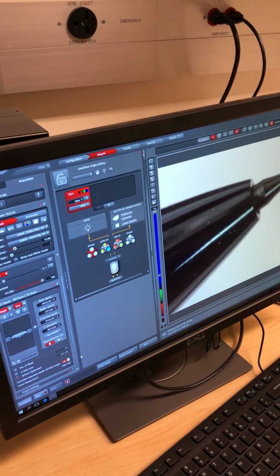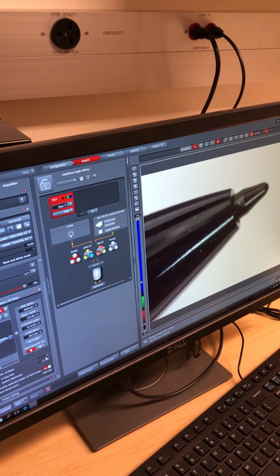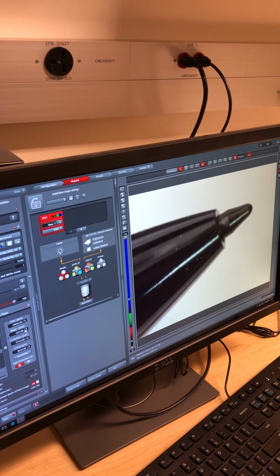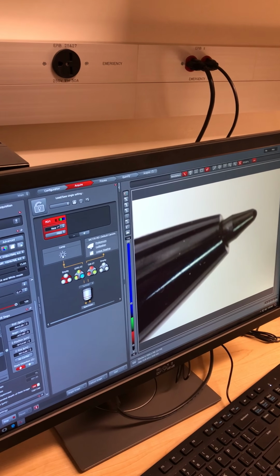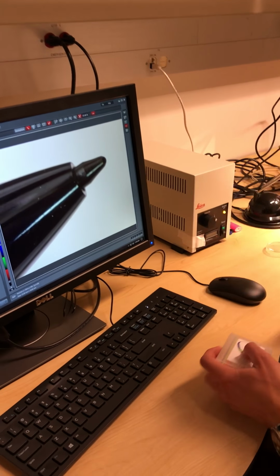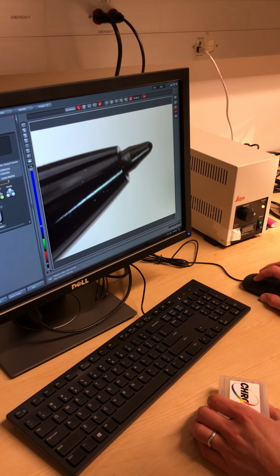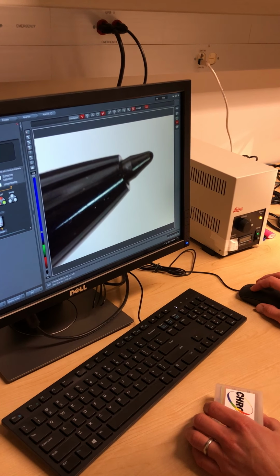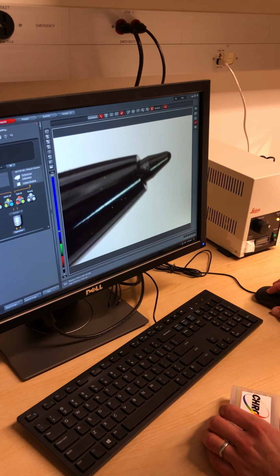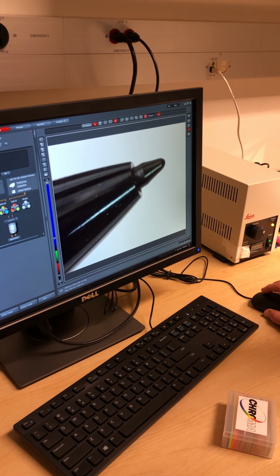And can you use your mouse to select the top and the bottom without me manually changing the focal plane? What do you mean? Can you just enter the number in there? Oh yeah, you could type it in. Or can you move it like you do in a compound microscope, moving the focal plane with this?